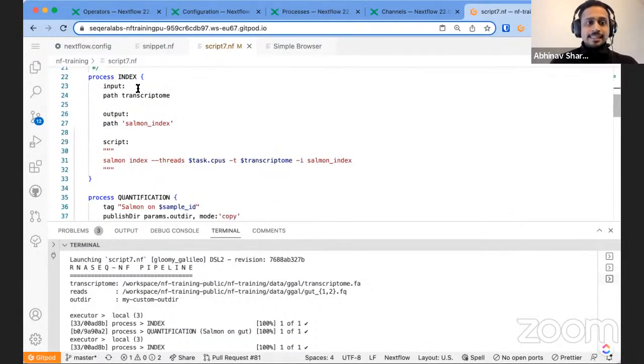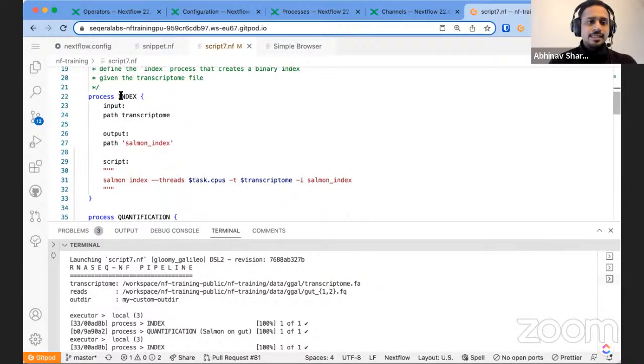So the next thing is a process. In this case, again, let's quickly recall the analogy we created yesterday. A process is really like a blueprint that is used to create a task which would run on your infrastructure, right? And this process, this blueprint of a task, needs to fulfill certain contracts, right? So the most important section, or technically the word is directive.